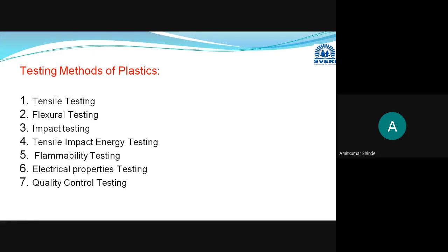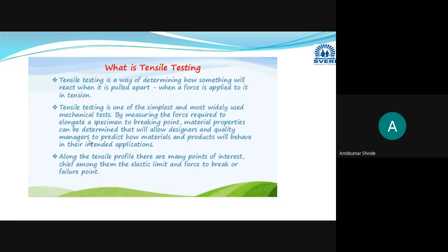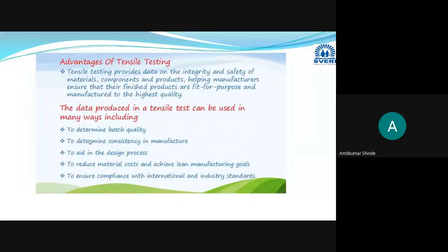So we will start with the tensile testing. Okay, I have summarized here why we are conducting the tensile testing. This part I think you have already studied in the metallurgy subject, so I will explain it with the help of the diagram here.